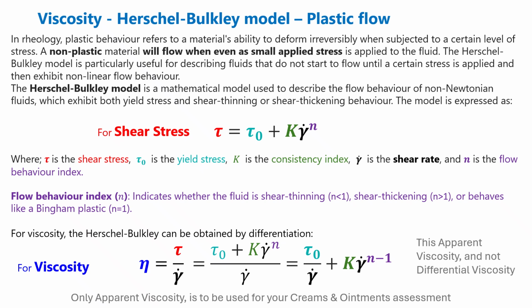And so what that will mean is that you will have that component feeding in even when you've got very low values of shear rate occurring. It does complicate the equation. It makes it much more difficult to fit data to this model. The Herschel-Bulkley model is more difficult to fit, and that is partly why I've tried to steer away from that in this particular assessment.